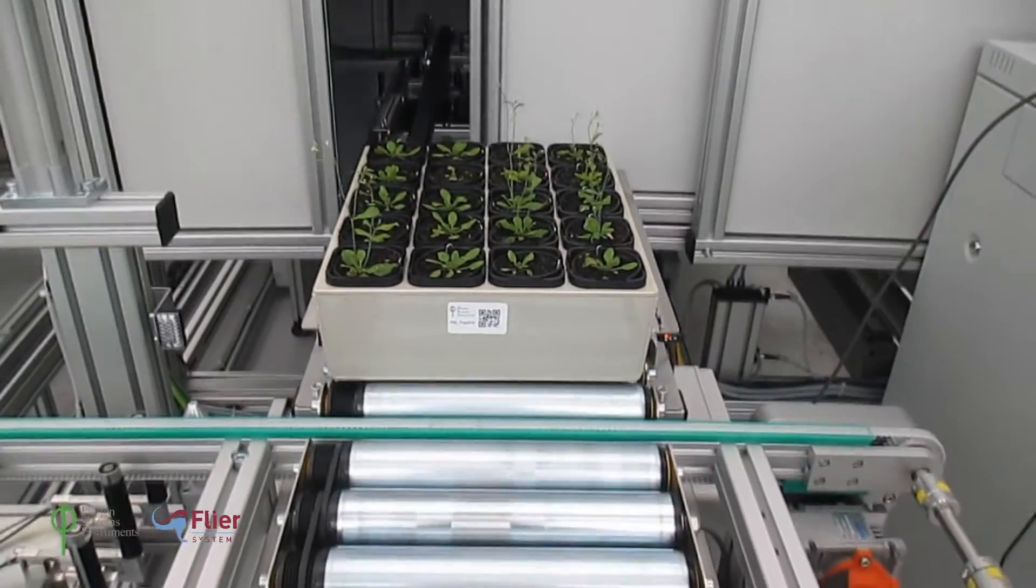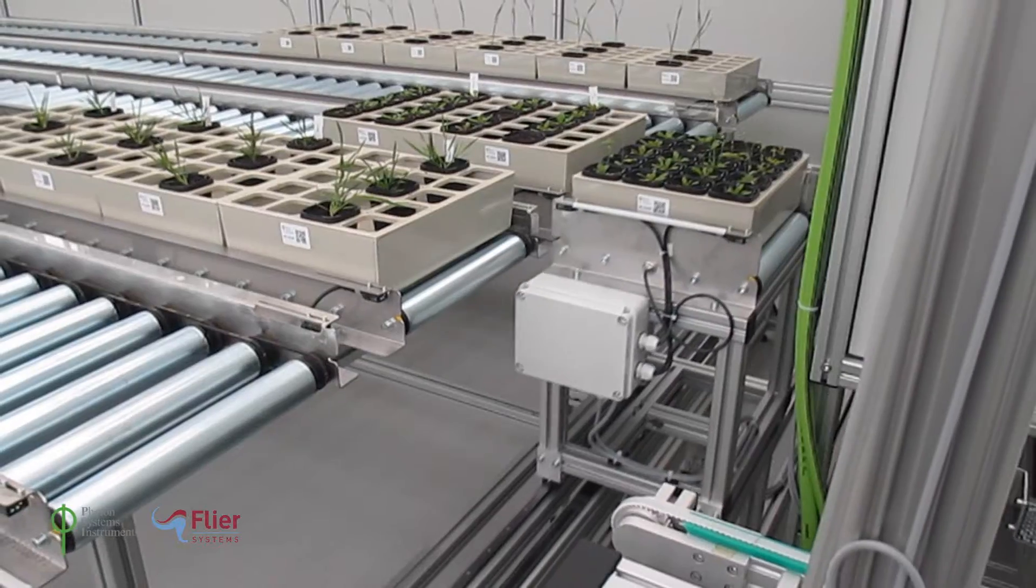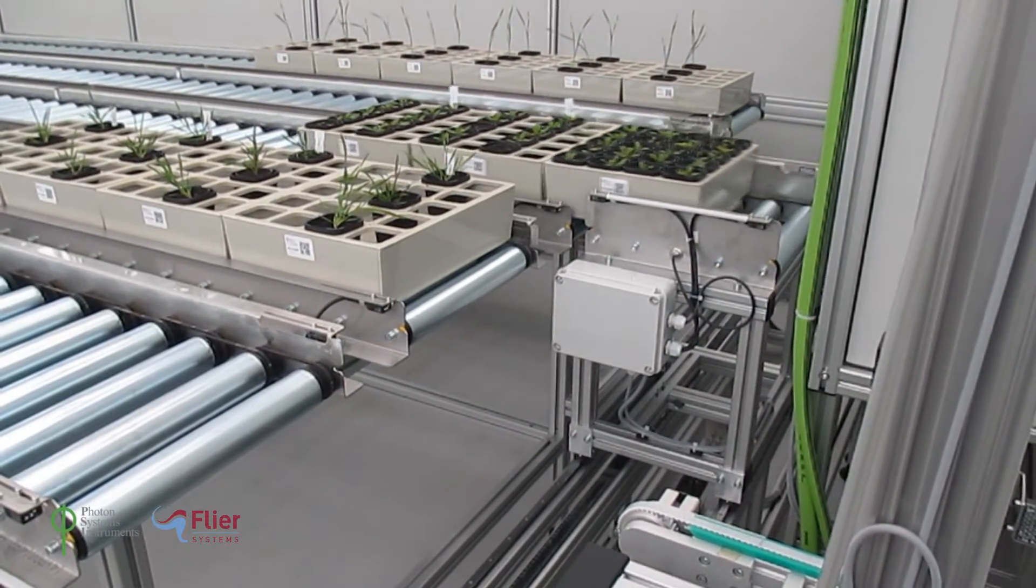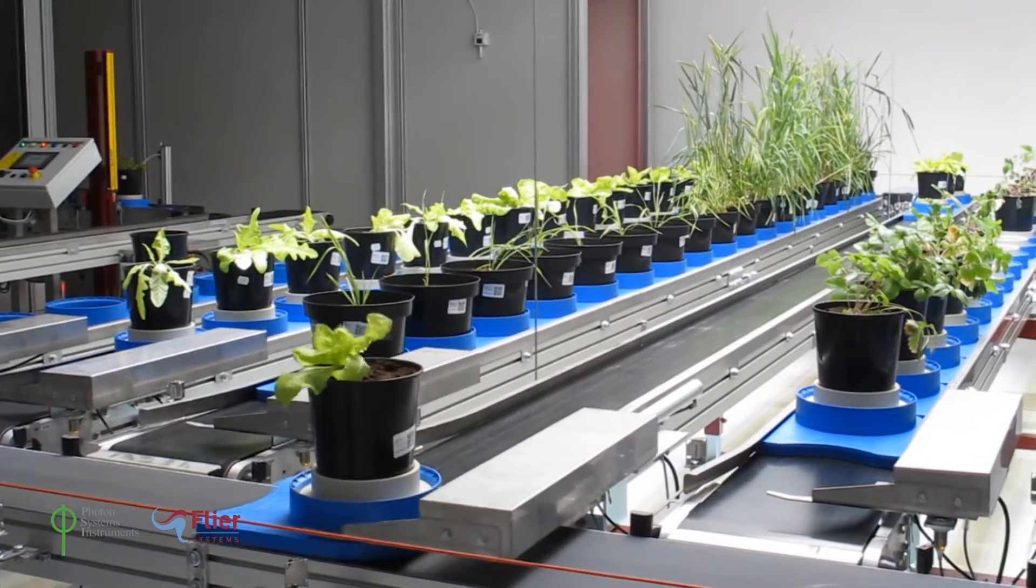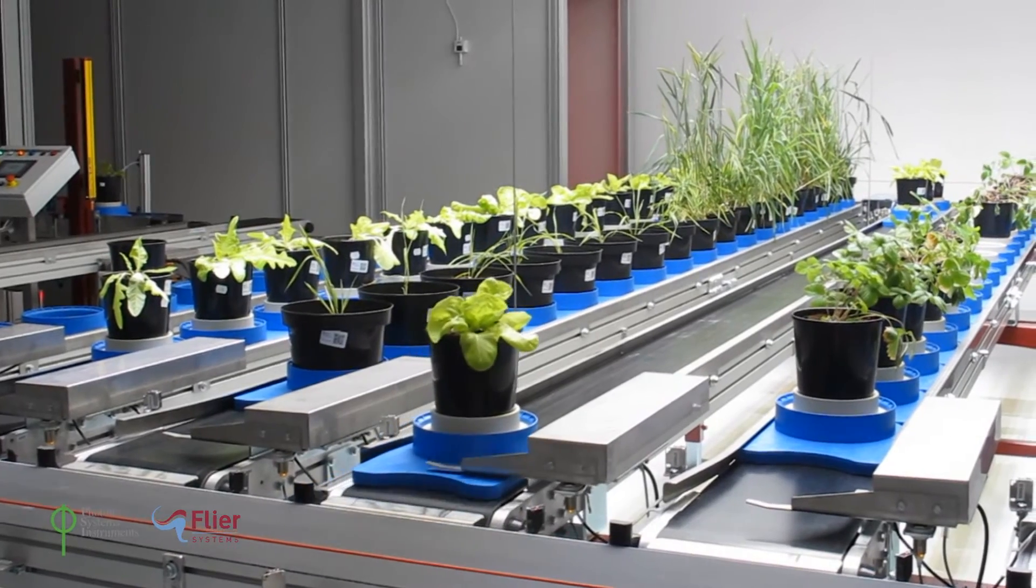PSI offers both small and large systems which may be connected to plants on a conveyor in a cultivation area. Systems can be optimized for the study of a wide variety of monocots and dicots from Arabidopsis to crop species.